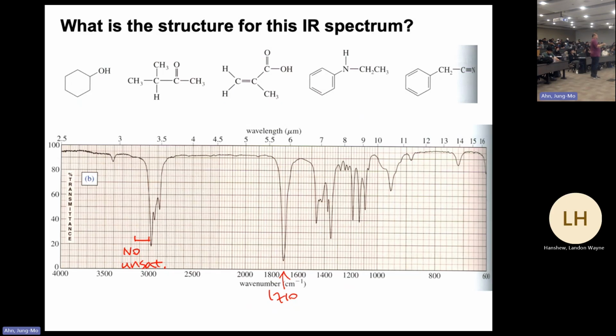But if it were that molecule, then you'd see the benzene, so you should have some unsaturation band. At the same time, if you have a benzene, I told you there's a signal, even if it's small, that you may be able to see at 1600. And at 1600, I don't see anything. So that means there's no benzene there, right?